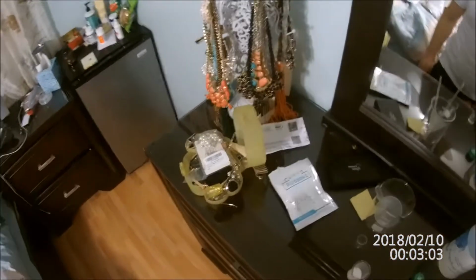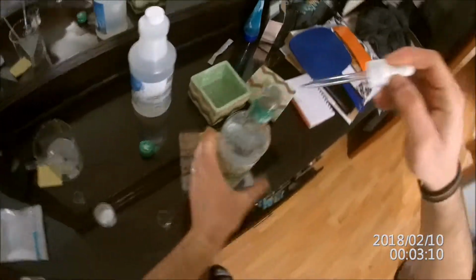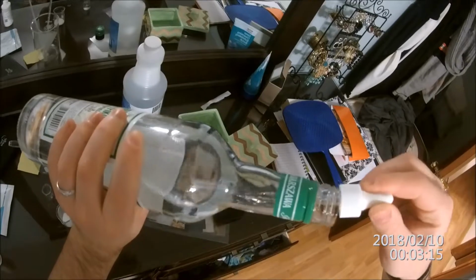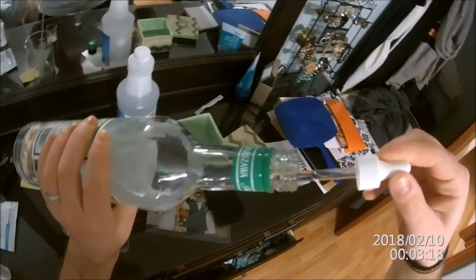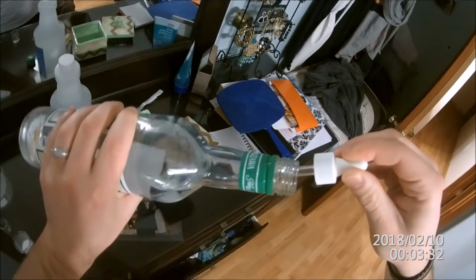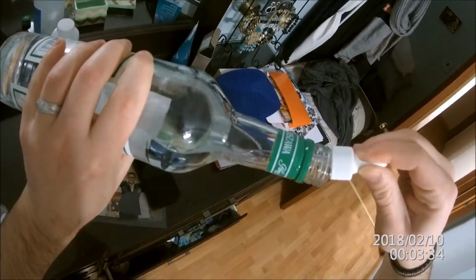Now, if you want to be a little bit more precise with this, you can do it in 1 milliliter increments. You can use this. This is 1 milliliter. So we'll go in here. We're just going to suck in a little bit more to get this to be 10. So it's exactly 10 now, and then we're going to suck in exactly 1 milliliter more.